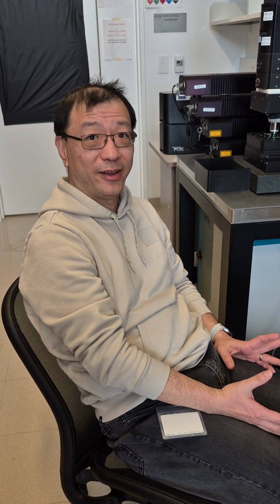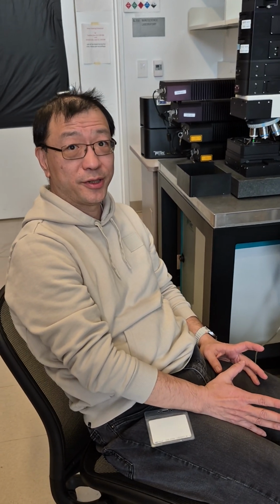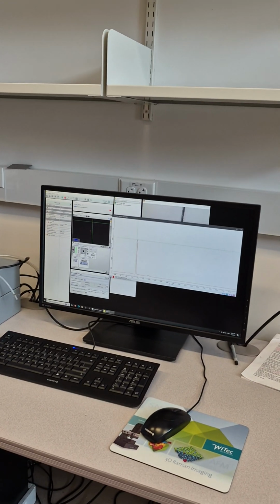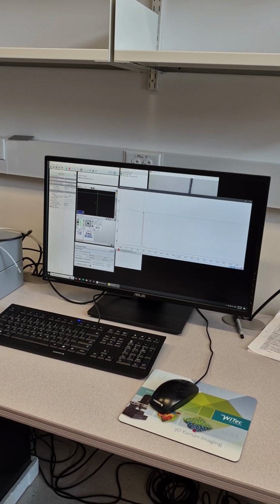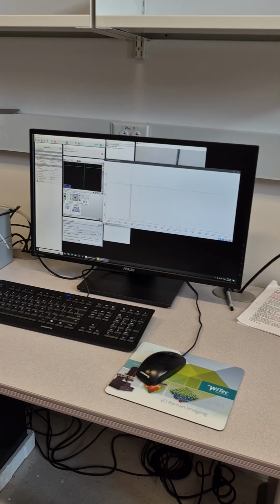I mean, you mean the difference? I think it's the difference. I just said your interest peak. Oh, okay. Yeah, I didn't mention any difference. Here it's above 2000, right? Yeah. Okay, so I understand what you mean by difference.